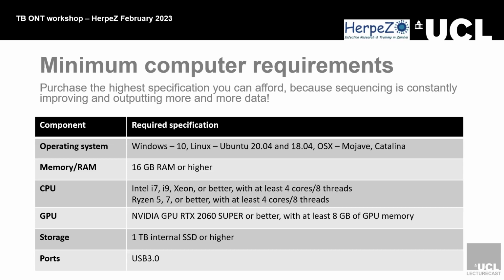So for Nanopore, I think it's the computer. And also if you're saving the data, you should only save the data onto the internal C drive or internal drive, because if you lose the link to an external hard drive or a cloud-based thing, then you're going to lose all of your data. So we have always been recommended to save directly onto your C drive and then move it out as soon as you finish, so you've got another terabytes worth of data for your next run.